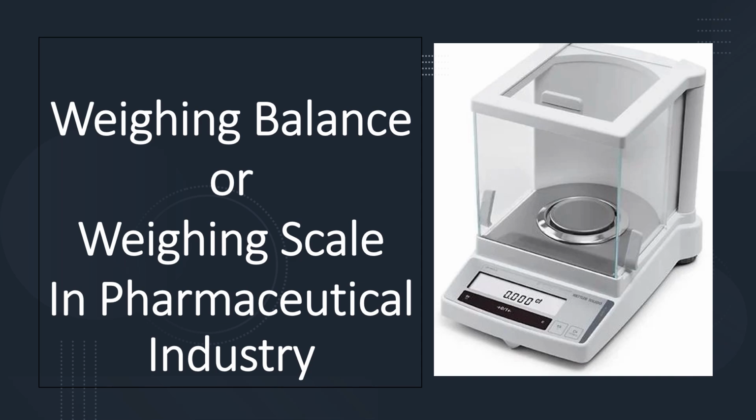Hello friends, in this video we will discuss the weighing balance, or weighing scale, in the pharmaceutical industry. We will understand what a weighing balance is and its importance, also the types of weighing balances and the general procedure for weighing solid and liquid samples.